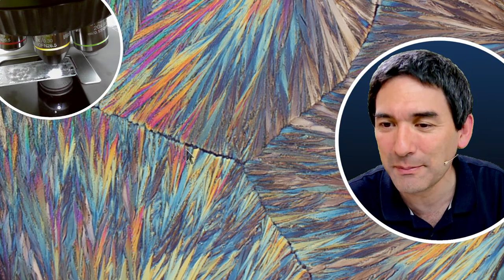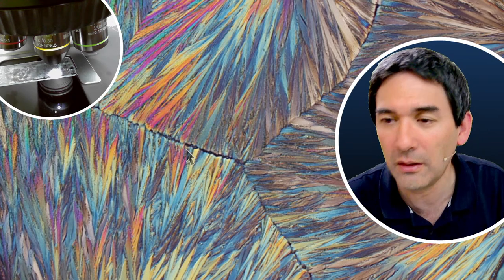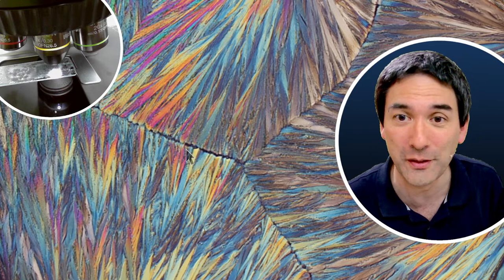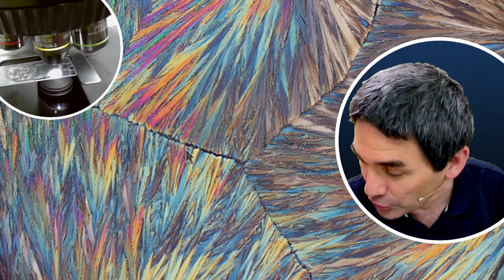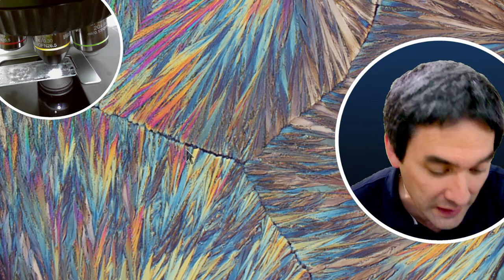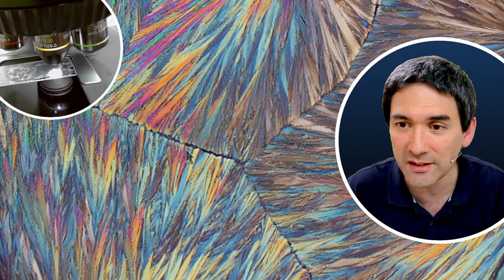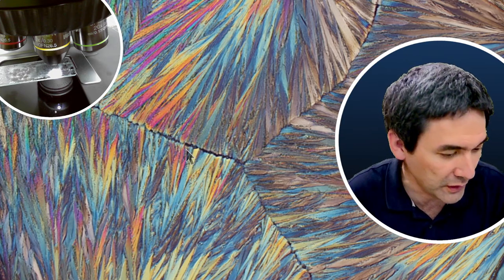So last but not least, what about starch grains? Oh, I forgot about the starch grains. Then let's do the starch grains, very quickly, the starch grains and the dust. And then I'm going to call it quits for today. So in 5 minutes starch grains, 5 minutes dust. I got carried away here a little bit.